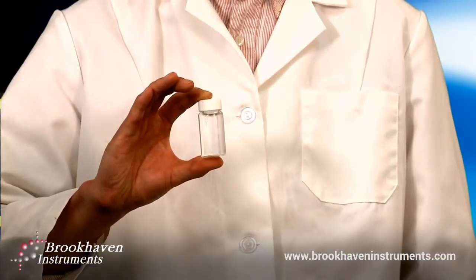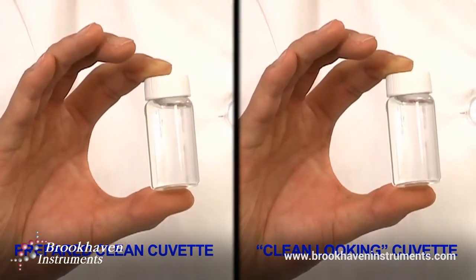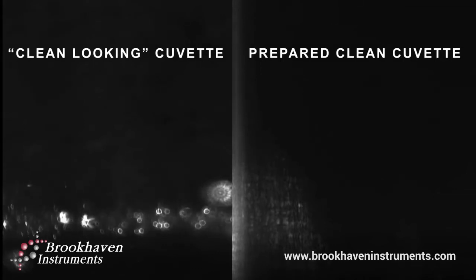Now to demonstrate how dust can interfere with sample preparation. Here I have taken a sample bottle and simply poured deionized water in it. I will place it next to a prepared clean bottle with the same liquid and shoot a laser through both. Please note the scattering of the laser is caused by dust particles in the liquid arising from the cell, cap, or from unfiltered liquid.